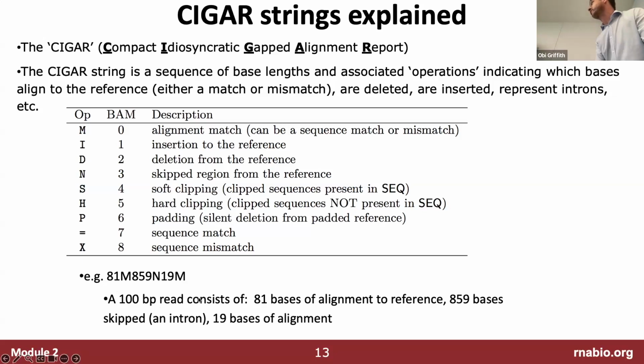So can you visualize maybe in a BLAST result what that might look like, and then think about how this is a barely human-readable representation of that. Mostly it's read by computers, right? So downstream software, like IGV, can take that and show you, okay, it matched 81 bases here, and then there's this gap, and then it matches over here. It's an efficient way of saying how the read aligns to the reference.